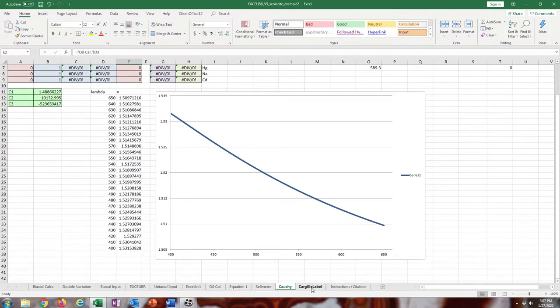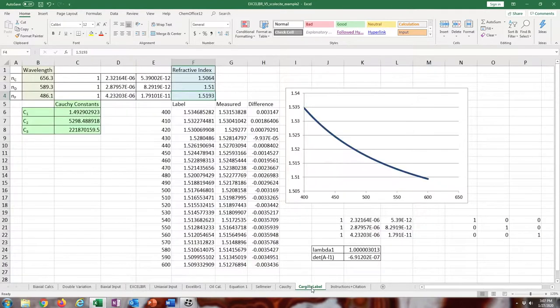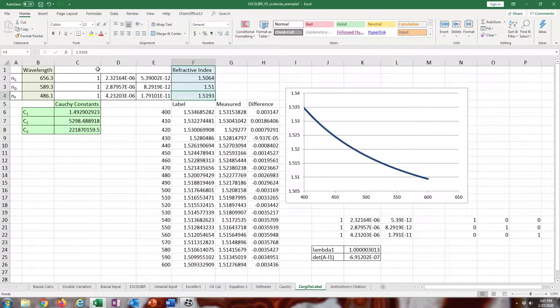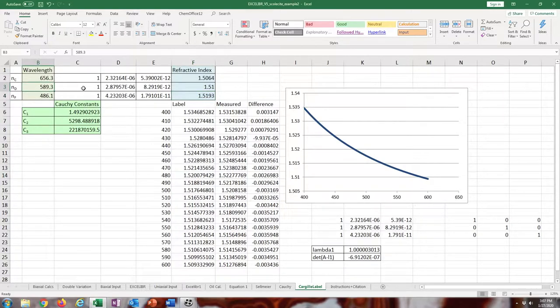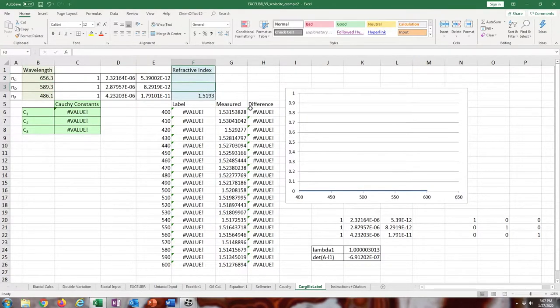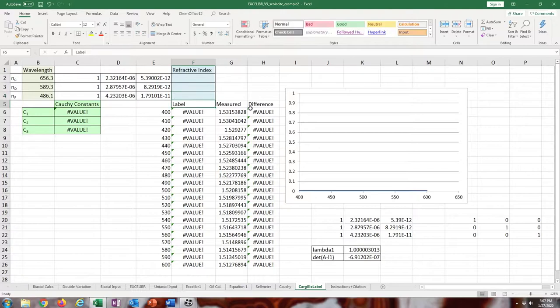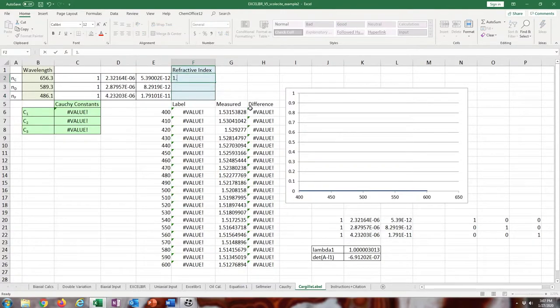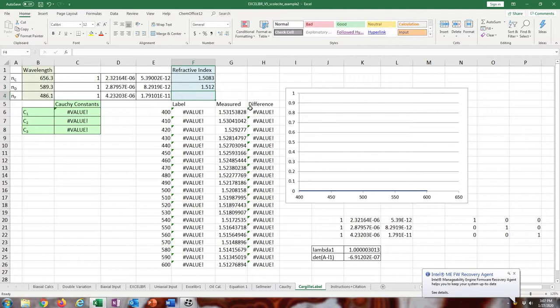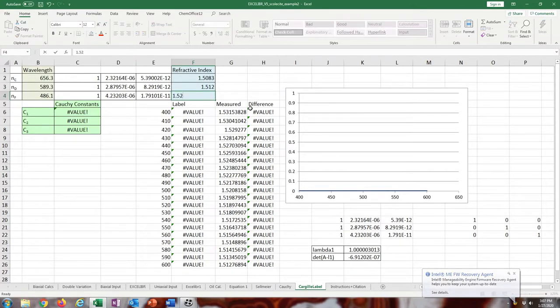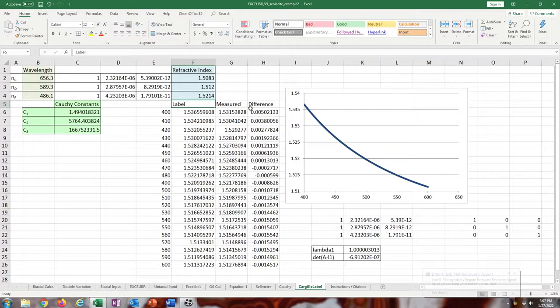Onto the cargo label. These entries are for a different liquid, this is for a 151 liquid. So I just have to clear these and I'm going to enter in the characteristics listed on this bottle. These are all at a standard temperature, and all of this is corrected for in temperature and everything.